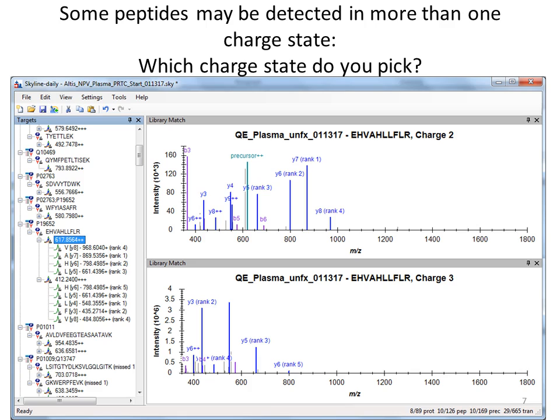So, can anybody tell me why we tend to look at the high m/z range for product ions and we tend to ignore this lower range? Does anyone know why that is? It's kind of by convention these days. Right, selectivity. So that was a test to see if you were awake. Good job. Earlier, what I had said was Y3 and Y2 ions tend to be really abundant, B3 in this case, and that's nice. That gives you intensity, but that doesn't give you the selectivity of making sure that that B3 or Y3 ion is from this peptide.